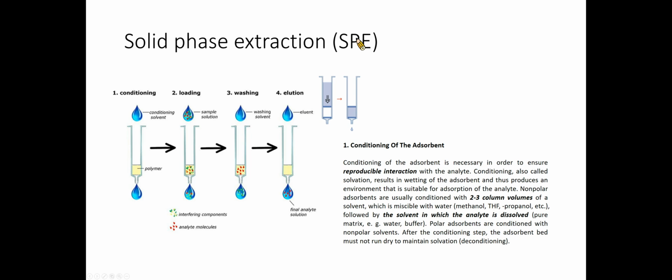The solid phase extraction has 4 major steps. The first step is conditioning, which can further be divided into 2 sub-steps: activation and initial condition.